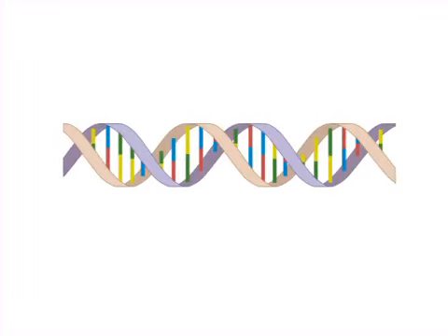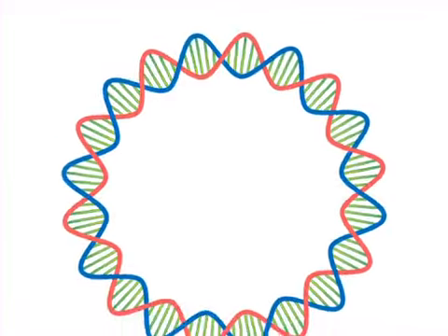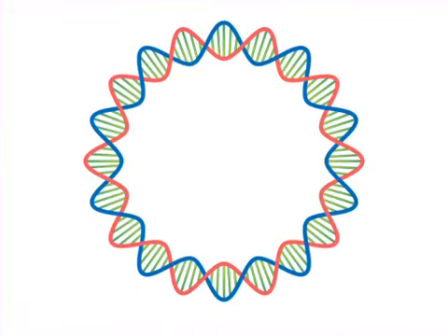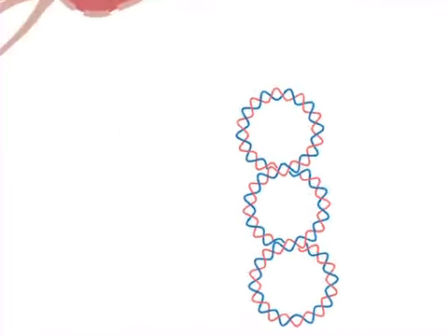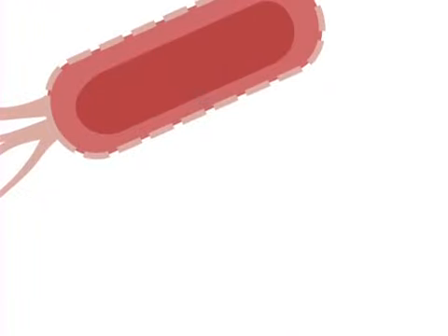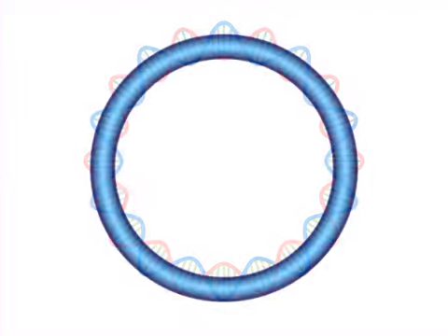Before we talk about the heat shock technique, let's first discuss the type of DNA most commonly used in bacterial transformation: the plasmid. A plasmid is a small, circular, double-stranded DNA that can reduce its size by supercoiling so that it can easily pass through pores in a cell membrane. A plasmid contains a few important regions worth mentioning.